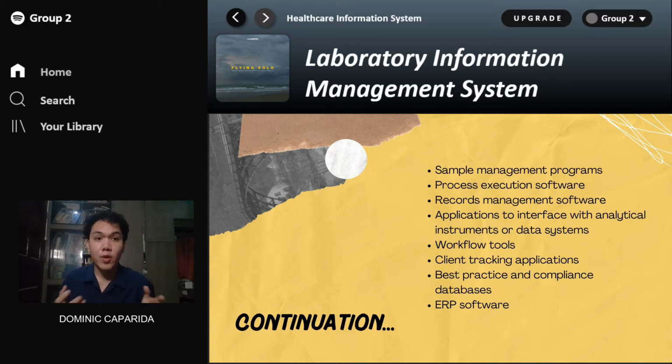So, workflow tools. It is a set of procedural rules for managing and coordinating tasks in the lab between the people and the systems. This involves a lot of lists where you list the workloads of the staff and the scheduled time, like what should be the rule inside the laboratory, how they should coordinate tasks with the systems, and a lot more.